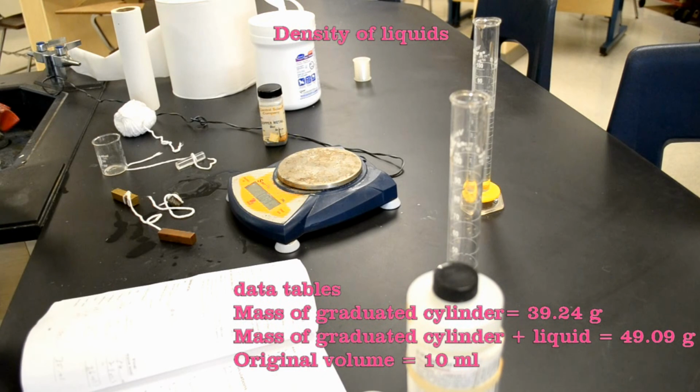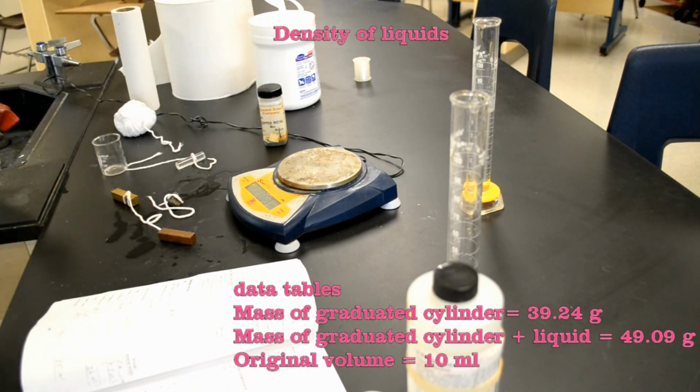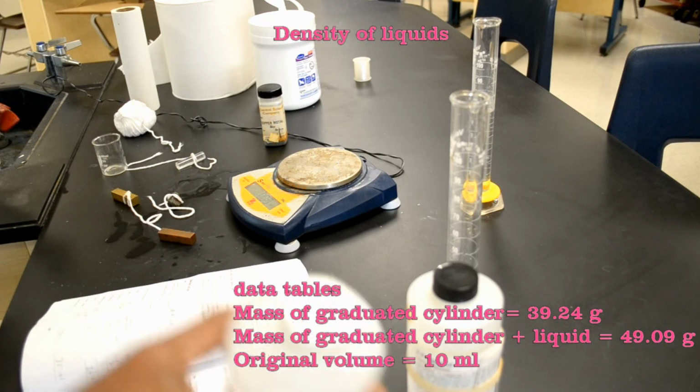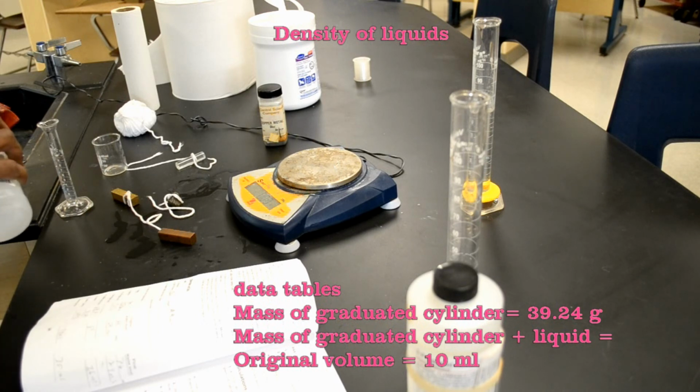I'm going to pour the water out and dry the cylinder. I'm going to add unknown liquid 1. I know what unknown liquid 1 is. It is ethanol, ethyl alcohol.